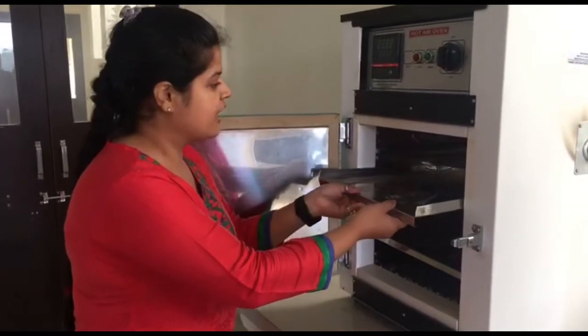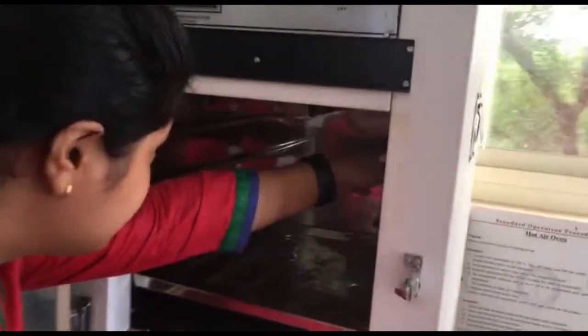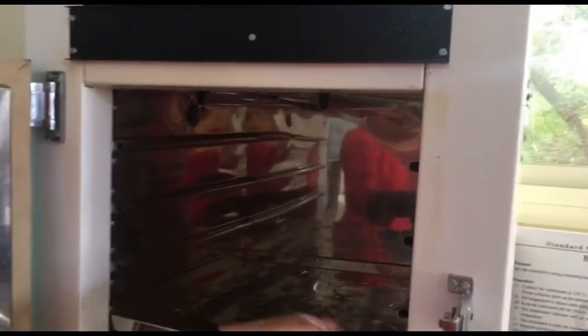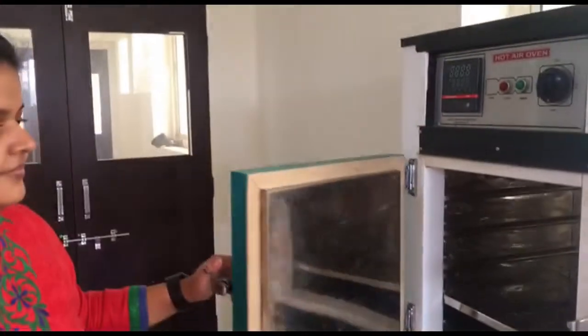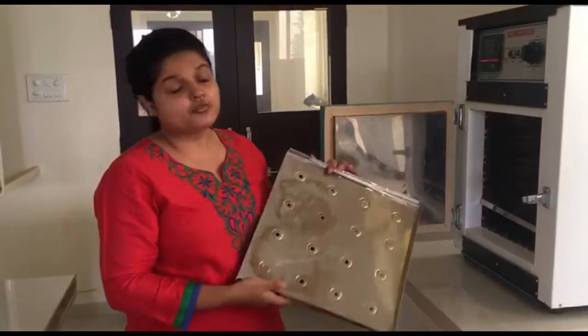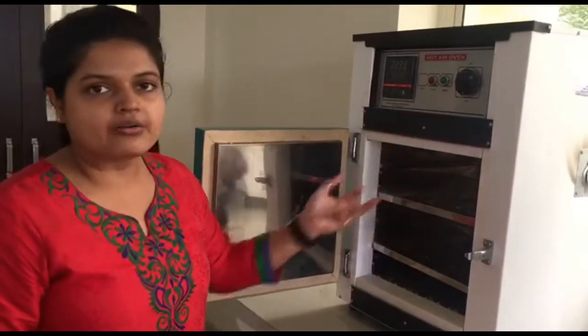Let me remove the trays to have a better view. You will find that there are two knobs inside the oven — two side knobs — which are for the exhale of the air. You will also find that the trays are made up of aluminium and they have some holes. These holes are known as perforations. Perforations are necessary for the circulation of hot air throughout the instrument.